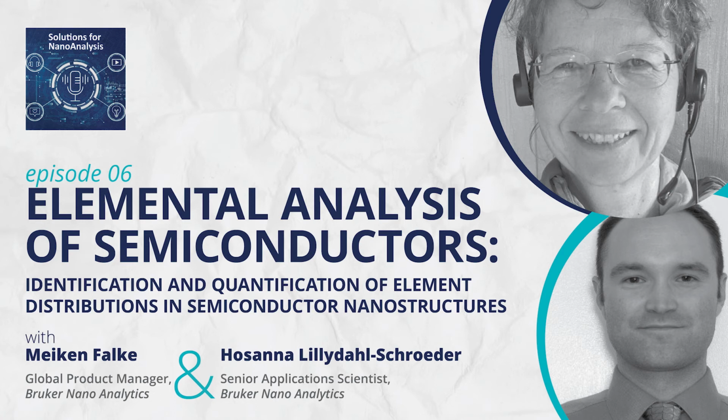And we have examples where it's clearly shown that the nitrogen, titanium and silicon whereabouts can be nicely separated from each other. So titanium nitride, silicon and pure titanium can be identified and also quantified in EDS.